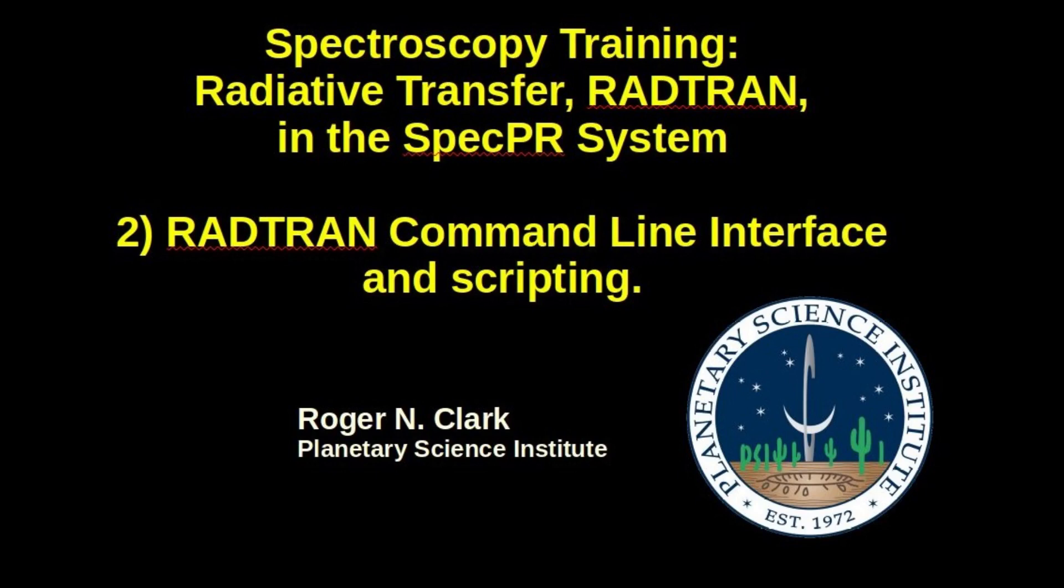In this video I'm going to demonstrate the radiative transfer program in the SPECPR system. Specifically I'm going to show the command line interface and how to make scripts. I'm going to compute a simple one component spectrum and then a two component spectrum.